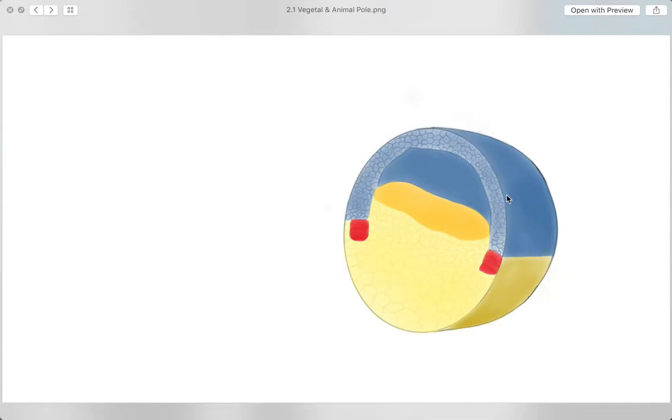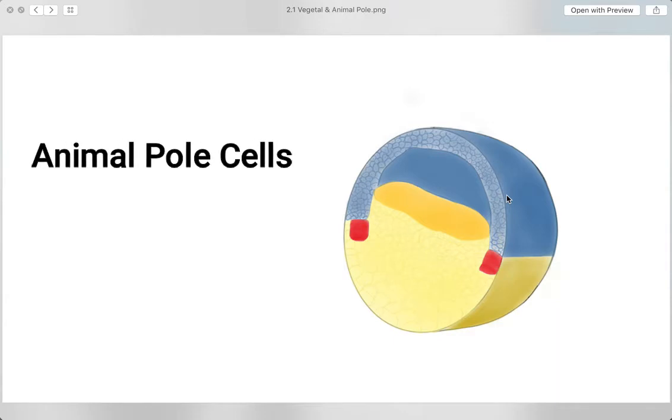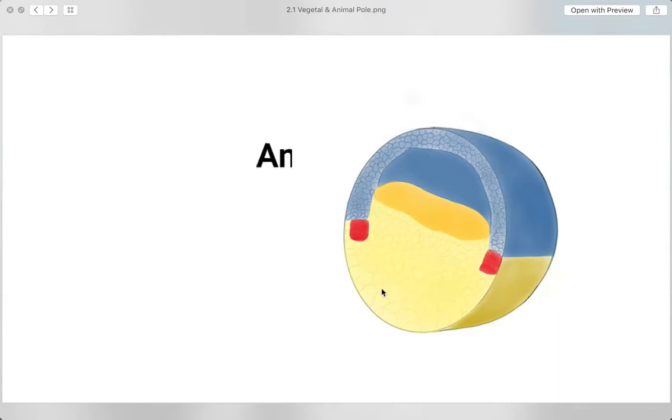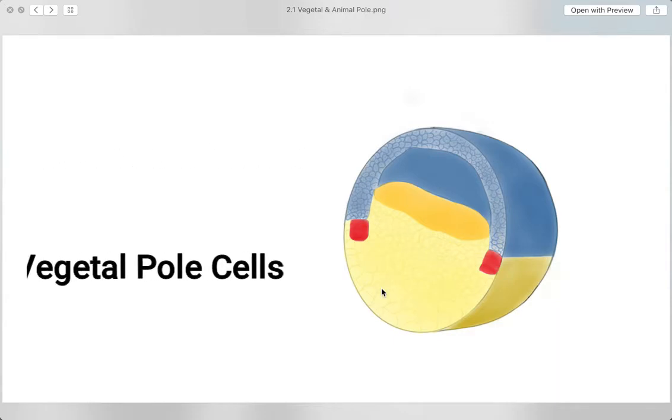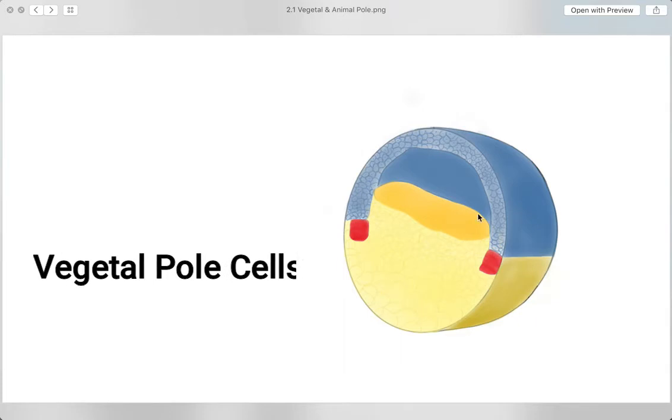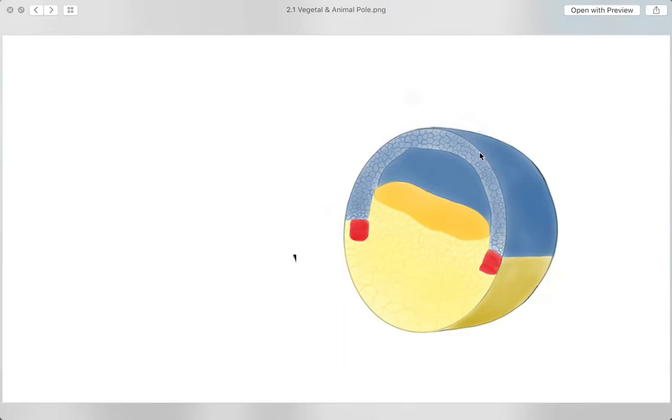The pigmented part is the animal pole cells, and the unpigmented part is the vegetal pole cells. The animal pole cells divide more frequently, thus increasing in number and appearing smaller as compared to the vegetal pole cells, which are yolk-filled, larger, and less dense during the blastula stage of development.